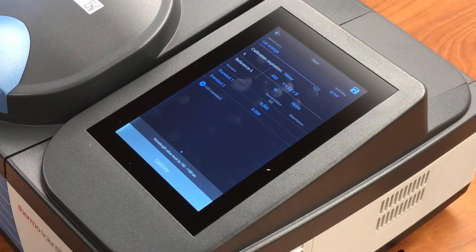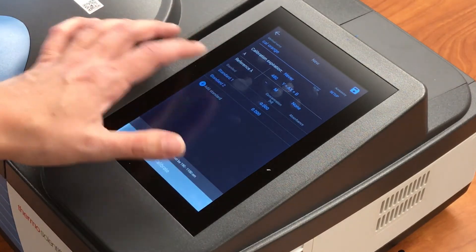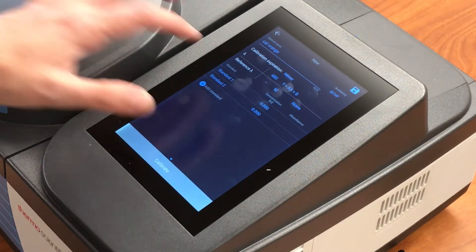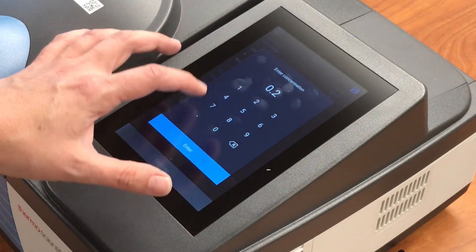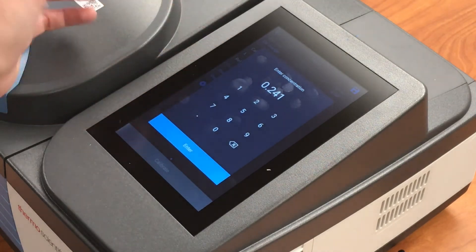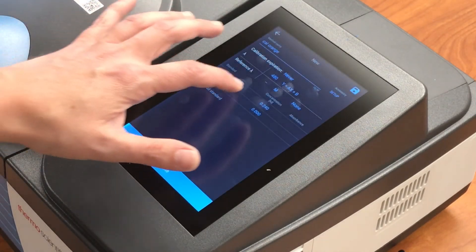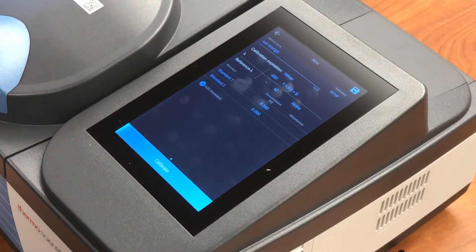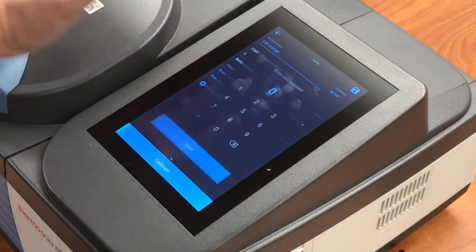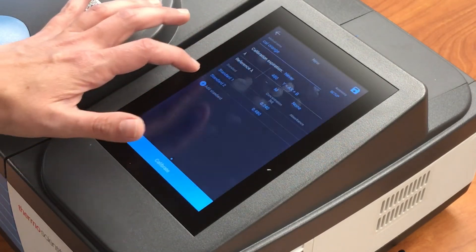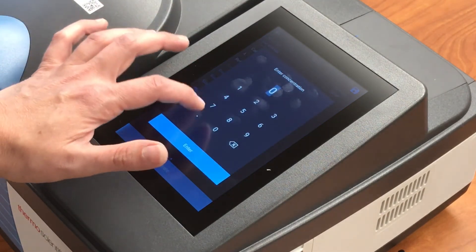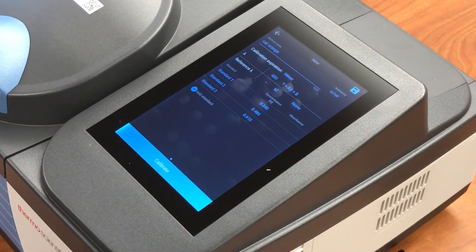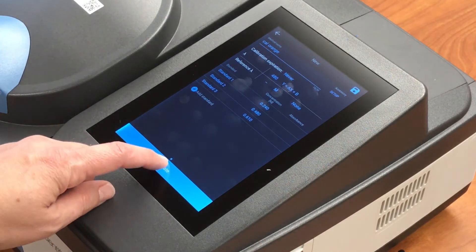Then you can input the concentrations of your standards by touching these values. So let's say our first standard has a concentration of 0.2 molar. You can put in here up to three decimal places. If you needed to put more in, you could do that in Excel, for instance. Standard 2 is going to be 0.48. If you wanted to add a standard, you touch add standard, and then from there you can add another one. Once you have all of those concentrations inputted in the table, you click calibrate.